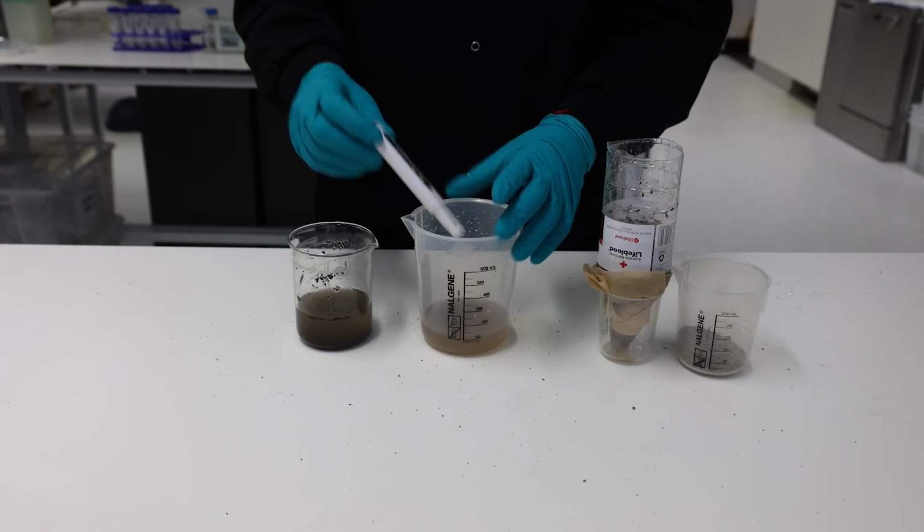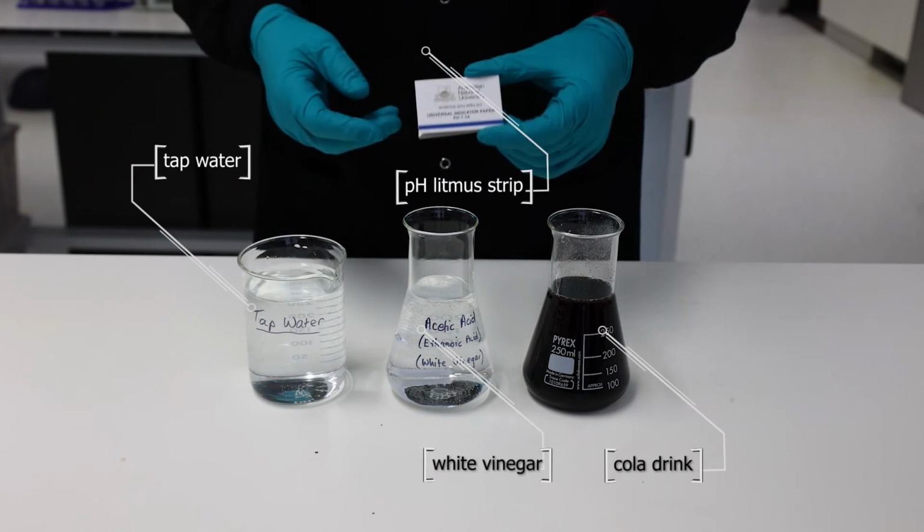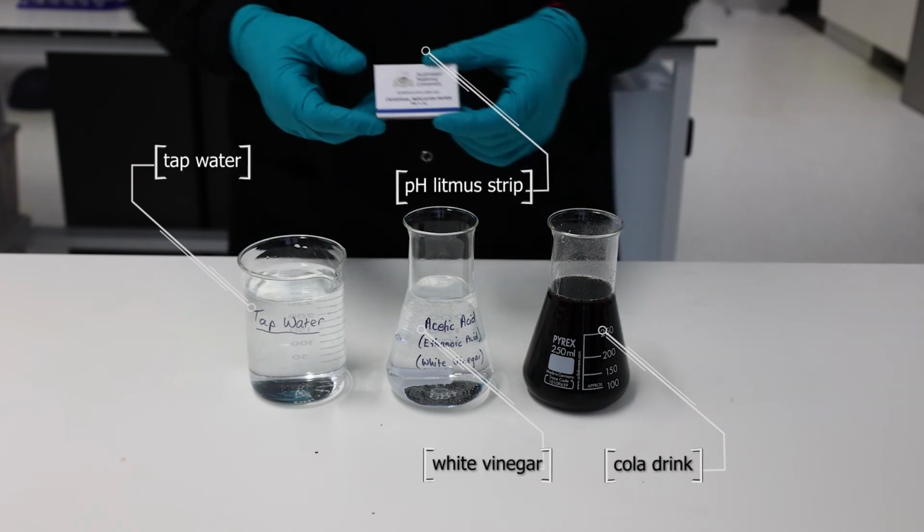Another important parameter of water is the acidity. So we measure acidity on the pH scale. If water is too acidic, then it can damage the humans drinking it, the ground, or the plants you're applying it to. Similarly, if it's too alkaline, it can be damaging. So what we want is the water to sit in a nice little range for different uses. In this experiment, we'll measure the pH of a couple of solutions. Here we'll use universal indicator paper.